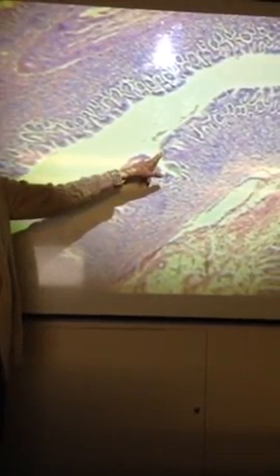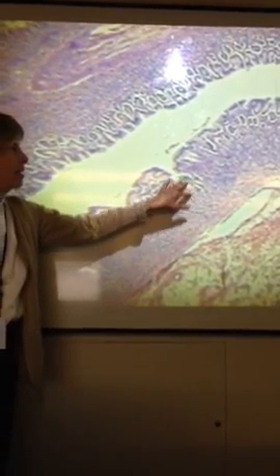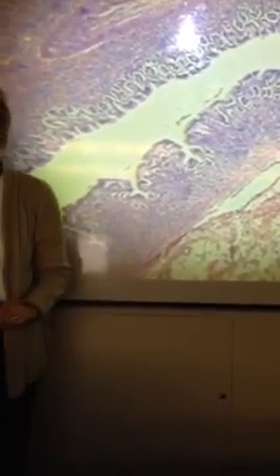And you would find very clear mucus cells, simple columnar cells that produce a lot of mucus. And then down within the gastric gland, the parietal cells, the chief cells, the G cells that produce gastrin, so the enteroendocrine cells. But that's all histology. We're not identifying those. So the magnification, closer to the magnification, and again, close because of the camera.